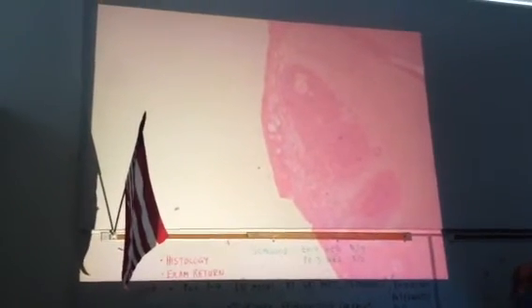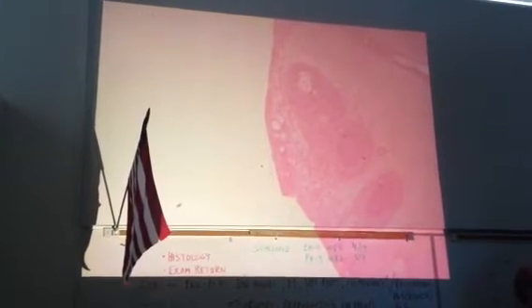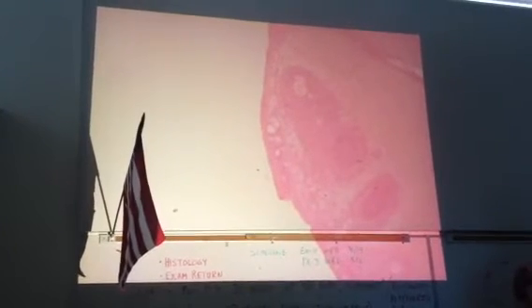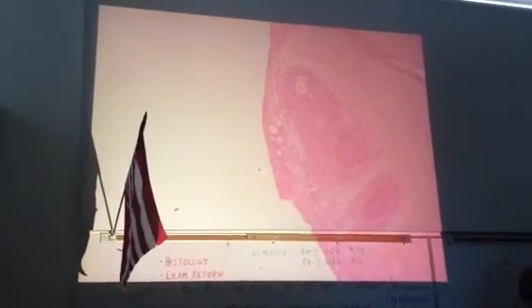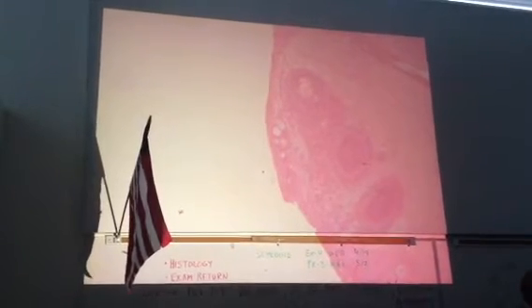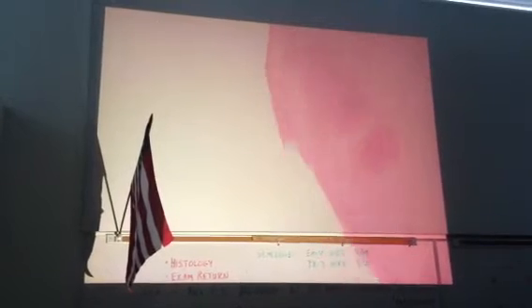It's gotten bigger. And then the secondary follicle is the one that's getting ready to be ovulated, and you pick it out because there's this half-moon shaped space that's filled with fluid. At the time ovulation approaches, a hormone will be released that causes smooth muscle around the outside to squeeze. When you squeeze on that follicle, there's no place for that pressure to go, and the fluid is going to cause the oocyte to be pushed out of the wall of the ovary. And that's what we're going to see right down here.